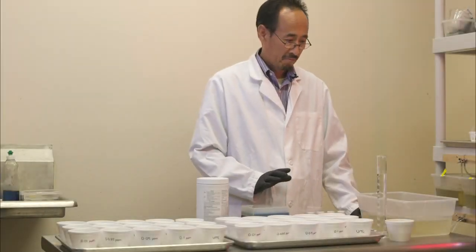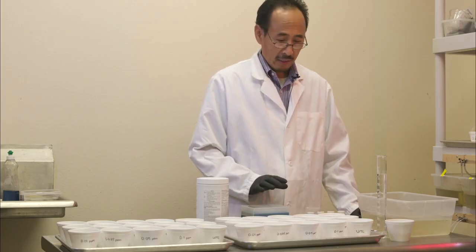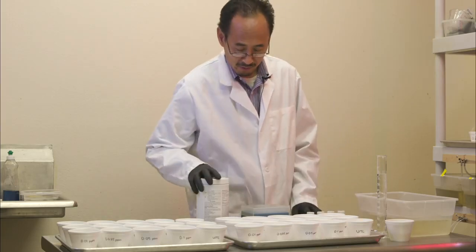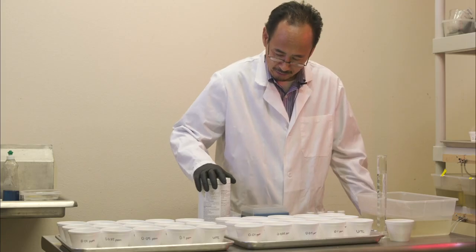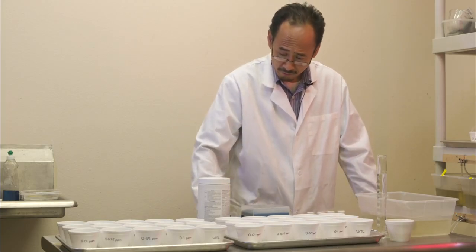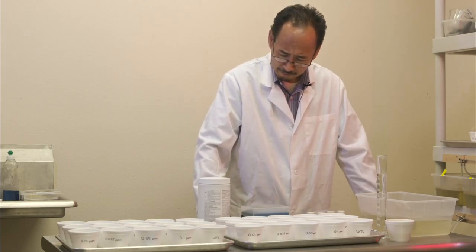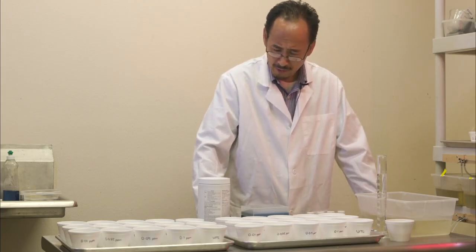This is the setup for bioassay for BTI. As you can see here, we have test material. It's a 37.4% water dispersible granules, or 3000 ITU per milligram water dispersible granule.